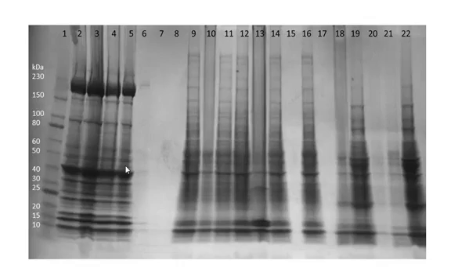I also want to point out that not all the protein in the homogenate, that is not all the protein in the organ, is represented on this gel, only the ones that are fairly abundant to begin with. If there's only 30 or 40 copies of a protein, our stain is not going to be able to detect that. It's not sensitive enough.